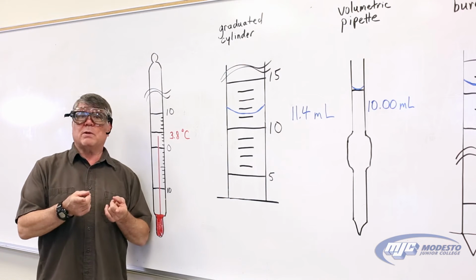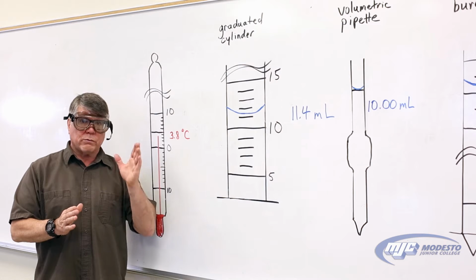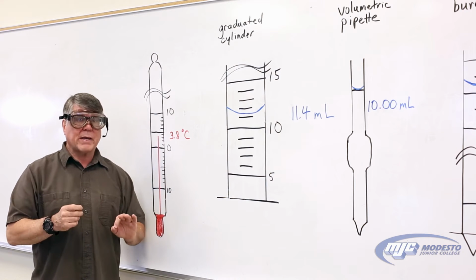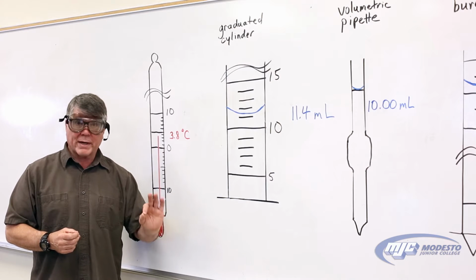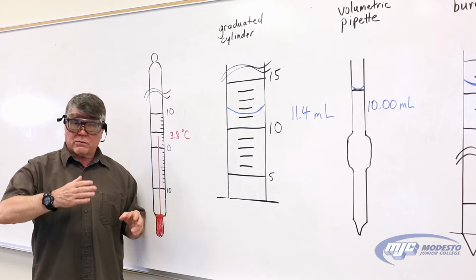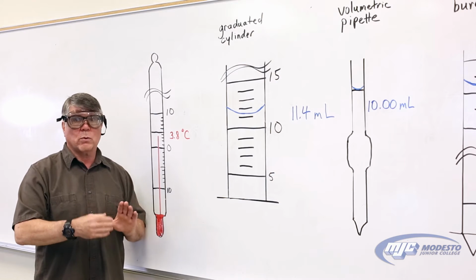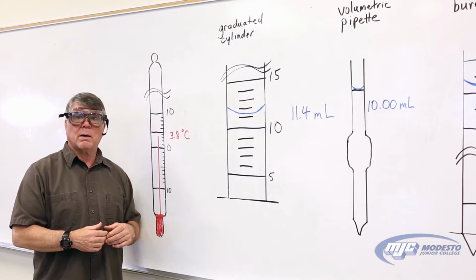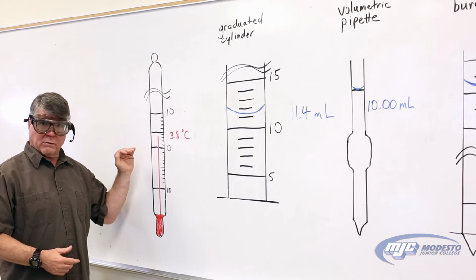Now, when we're measuring the temperature with a digital thermometer, any digital instrument, you always record every digit that you see in the display. With the thermometers that we have for this experiment, it's always one place to the right of the decimal, which means if it says 10.0, that 0.0 is important, so you should record 10.0, not just 10.